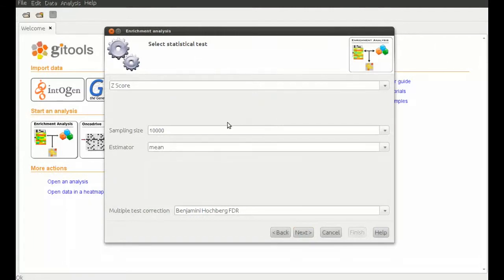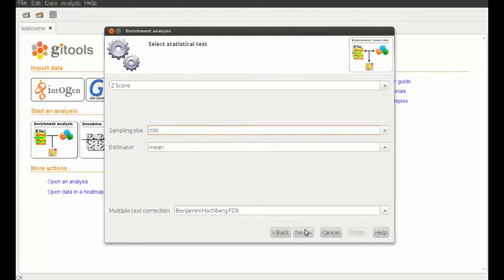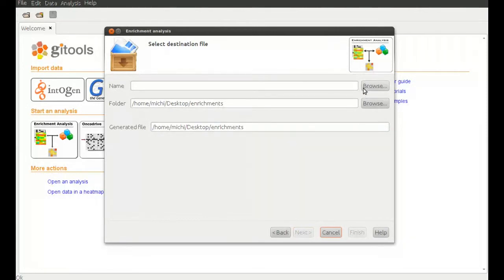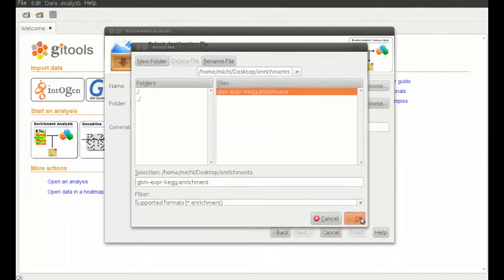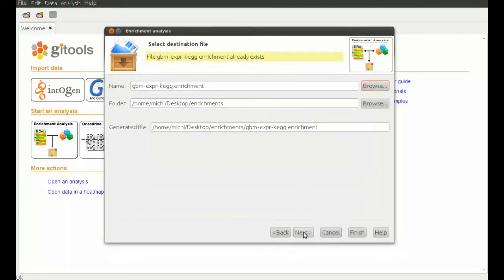Note that just for time reasons, we reduce the sampling size to 100. Normally we would leave the default value. In the end, we choose where to save the result, give a title to the analysis, and hit finish.